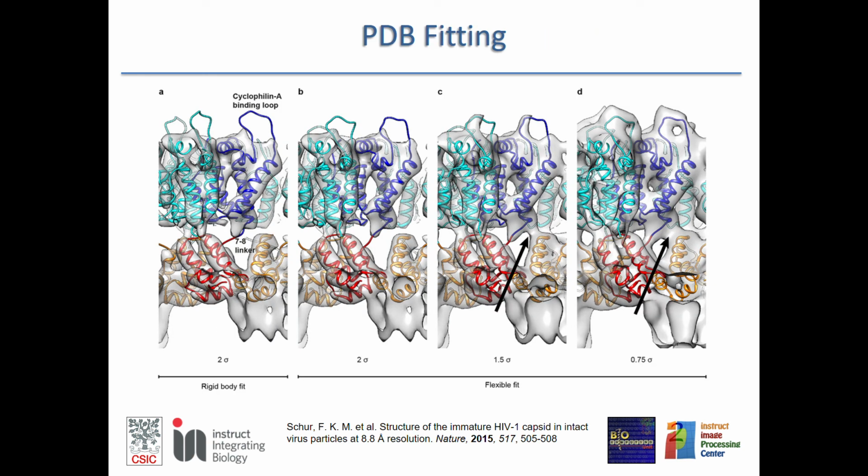And otherwise, we have seen tools that can be applied directly on the volume, or on the volume and the images. If you have a good structure, or enough resolution, an atomic model should tell you whether your structure is compatible with it.